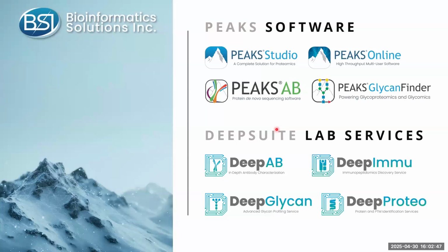To start off, for anyone who may not know what we do at Bioinformatics Solutions, we offer software solutions for proteomics, antibody sequencing, and glycoproteomics. As well, we have a lab here in Canada, and we offer lab services for researchers who would like to send samples to us for analysis. But today's webinar will focus primarily on Peak's GlycanFinder version 2.5, which we released in early March. And we actually have a patch build coming out as well with some additional features.